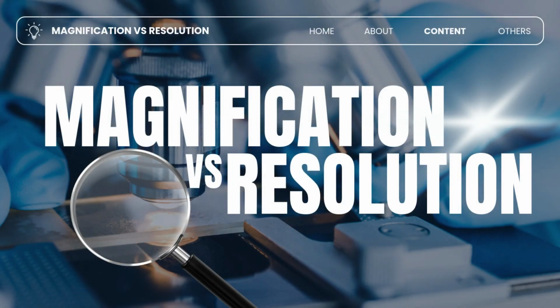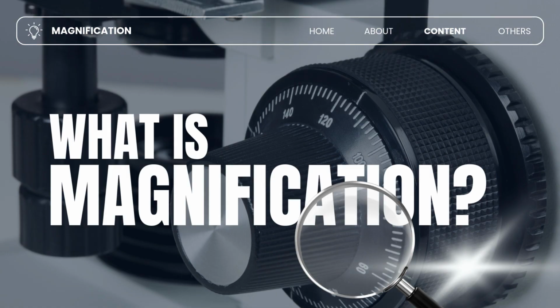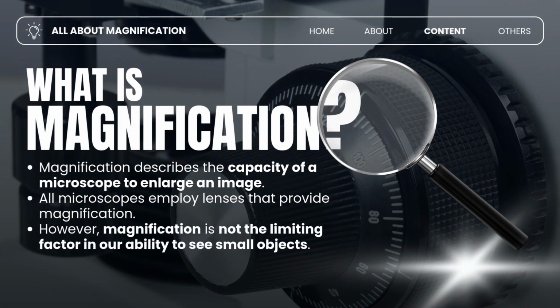So now, let's describe the differences between magnification and resolution. So, let me ask you, what is magnification? Magnification describes the capacity of a microscope to enlarge an image. It is also important to note that all microscopes employ lenses that provide magnification. However, magnification is not the limiting factor in our ability to see small objects.